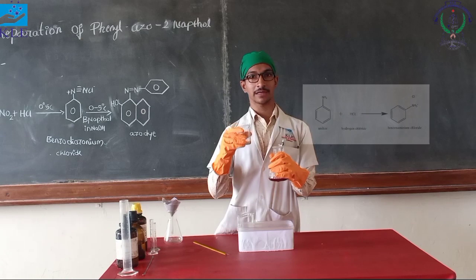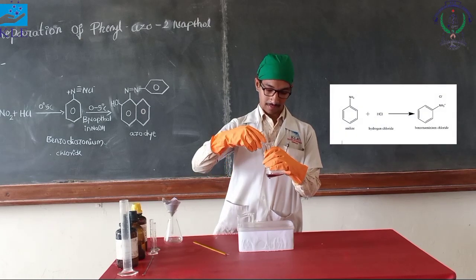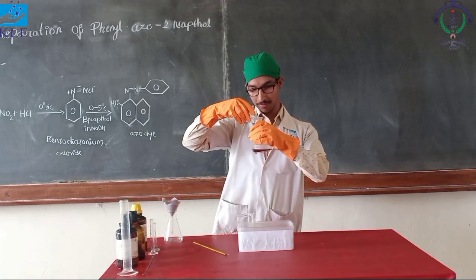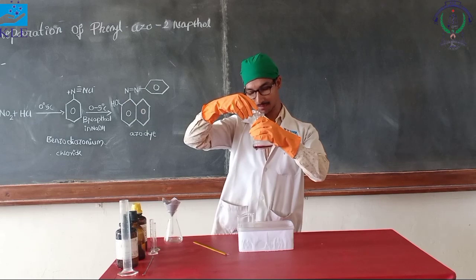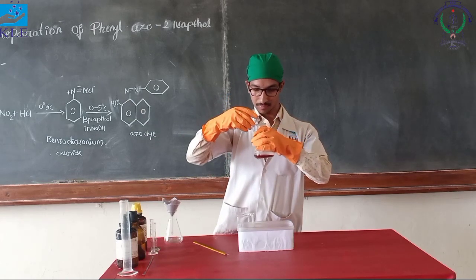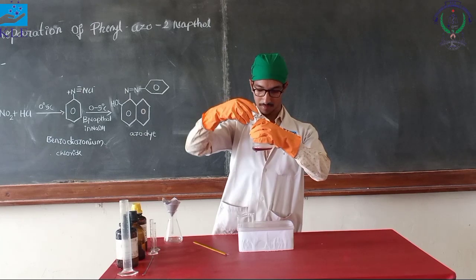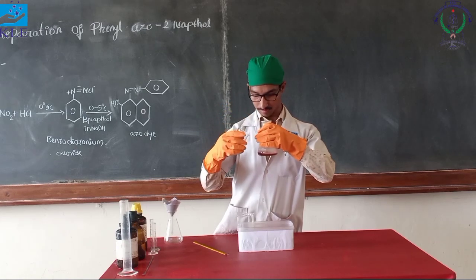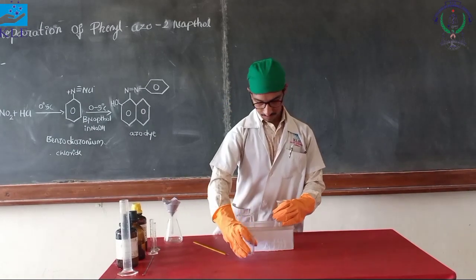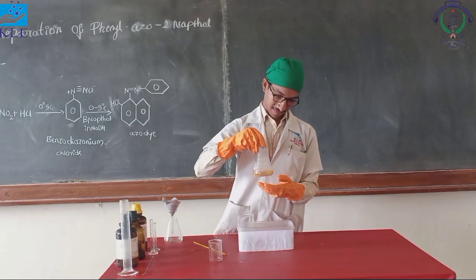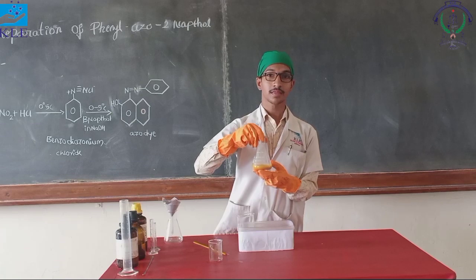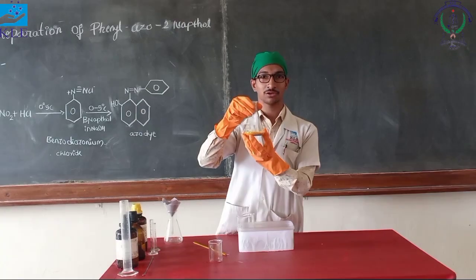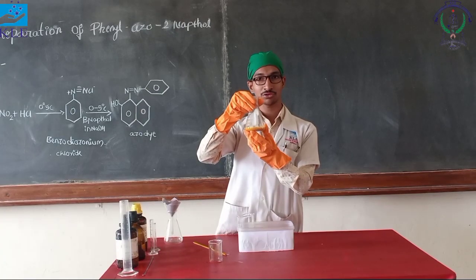Now add the ice-cold sodium nitrite solution to the ice-cold anilinium chloride solution with constant stirring, added dropwise. The solution has turned orange in color. This is now called the benzene diazonium chloride solution. Keep it again in the ice bath to bring the temperature back to 0 to 5 degrees Celsius.